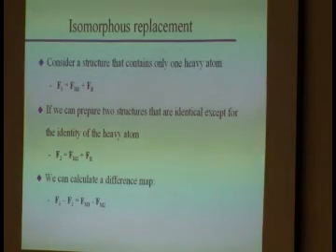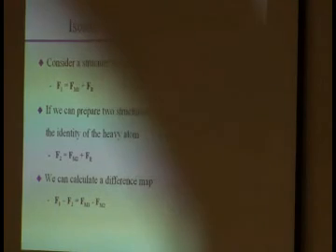Now, at this point in time, we'll actually do a Patterson, as I promised you, okay? I think it'll be very useful to actually get some idea of how you deal with the data. Because all that talk about Pattersons and locating atoms and stuff like that kind of only starts to make sense when you actually have to do it yourself.